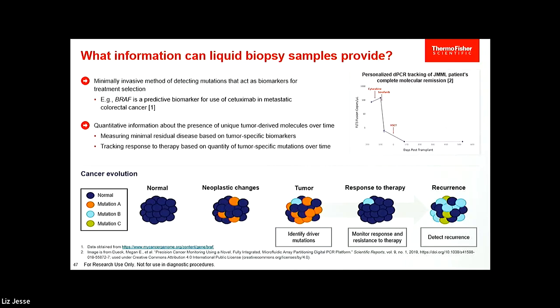So they took a genetic profile of the tumor, they developed a panel, and then they started treating the patient. As you can see, in the very first step, when they used a treatment, it was not effective at all and had no impact on the decrease of mutation cells, the cancer cells. On the second treatment, they did notice a significant impact in the change of the mutation cells, the rare alleles that were there.